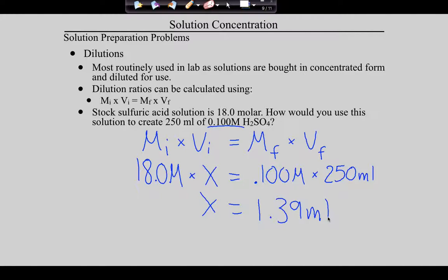So we literally use this stuff milliliters at a time. I shouldn't do this, but this is 2.5 liters. So this is 2,500 milliliters, and we use it milliliters at a time. You understand why that lasts so long?